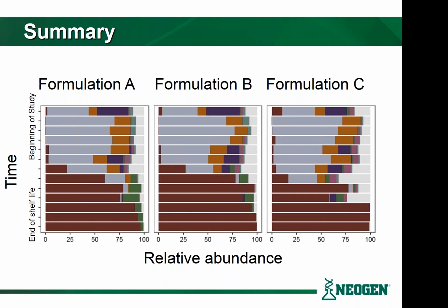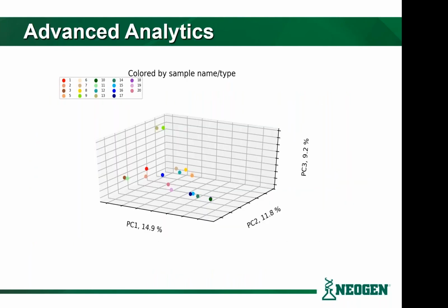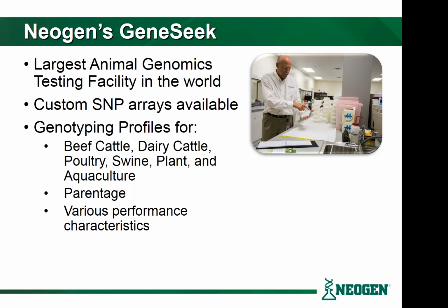The other really important thing that we'll see in a lot of these reports, if you were to go through with this, is what's called a principal component analysis. So this graph might seem daunting, and we're not all microecologists. And one of the things that we like to do to help people understand what's going on is provide some analytics behind it. And this one, after you look at a few of them, and we would help you get through the data sets, is that they're grouping the different samples together. And these groups of samples are telling us key differences between the different formulations or microorganisms or control versus variable. And this is helping us go in and look at specific samples to look at what is potentially the problem.